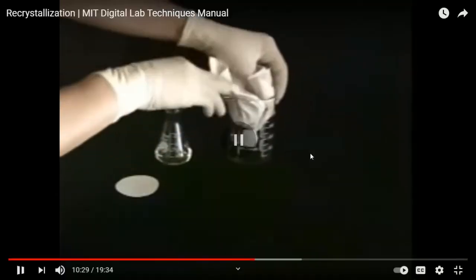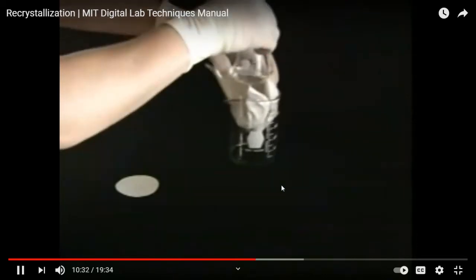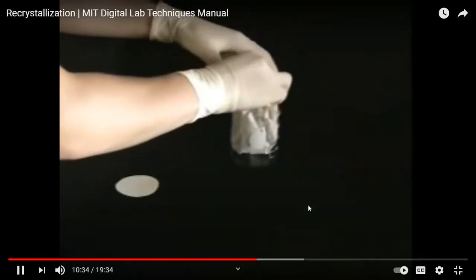The flask can also be placed in a beaker stuffed with a paper towel to slow down the cooling. See, even slowing down cooling with the insulation. That's the MIT method. That's what we do in your college lab as well when I teach. And promote slow crystal growth. This is especially helpful in a cold laboratory.